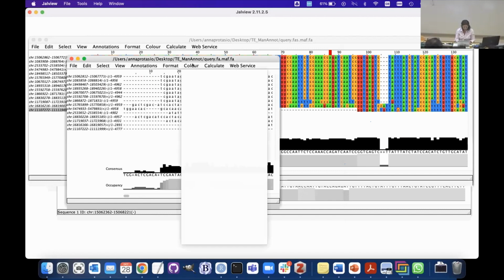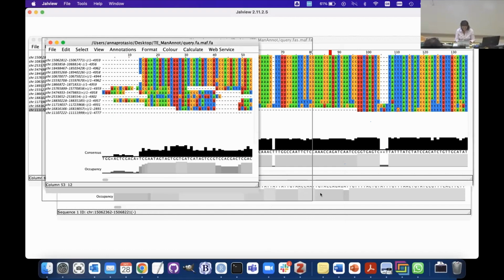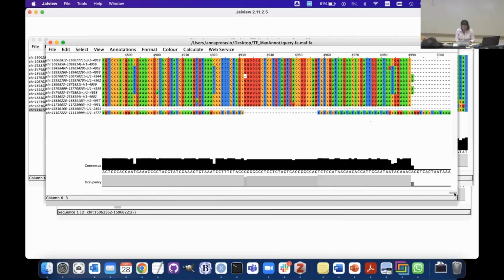Okay. So this one has some more sequence on the side. It's also picked up a bit more of things that don't align very well. But this block, I'm not entirely sure that's the end of it. Not entirely sure. And let's look at the other end. The other end looks pretty conserved, and this one is the case extending it, but there's probably more sequence there.